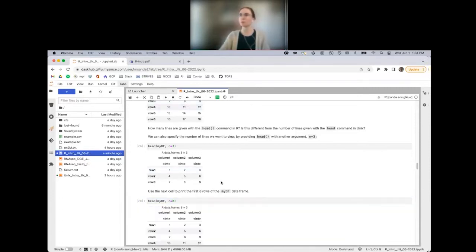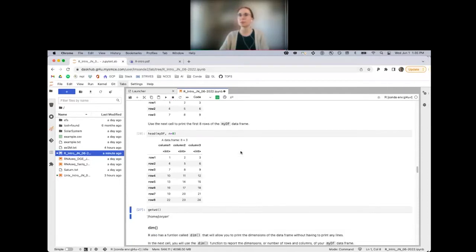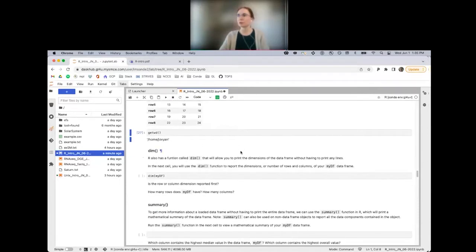Run that cell. So if anybody does not see how I got here, please shout out, and I can go over that again. Any questions about the head function? Okay, great.